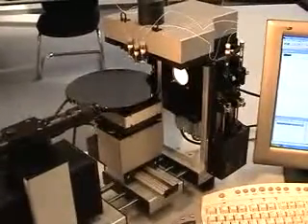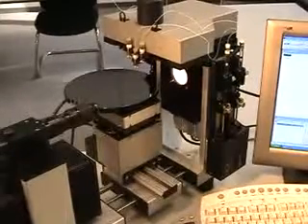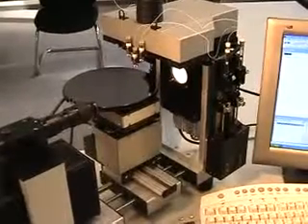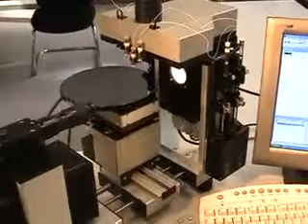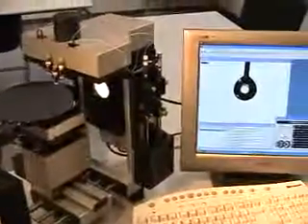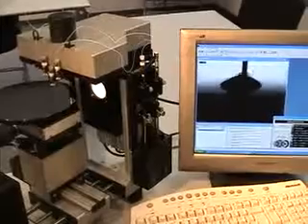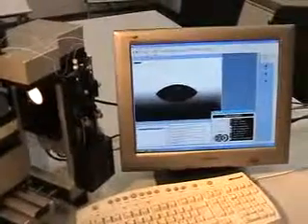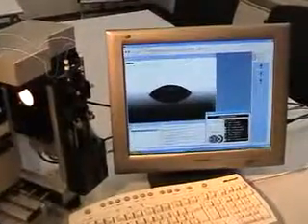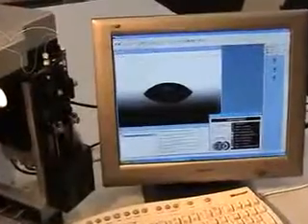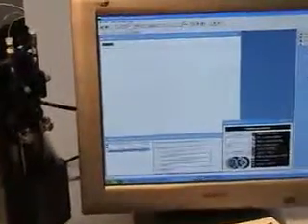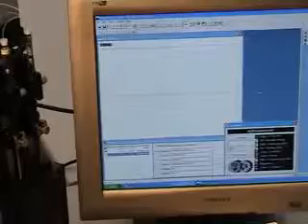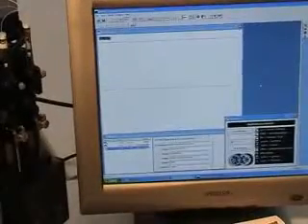Next measurement point is assigned now. Here we see the dosing. The droplet has been picked up. Measurement is being done automatically. So this will run now all the time until we have completed our set of coordinate measuring points.